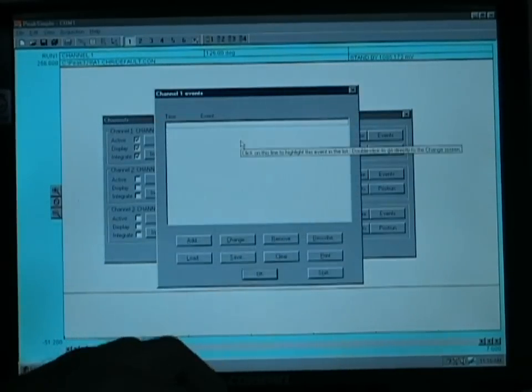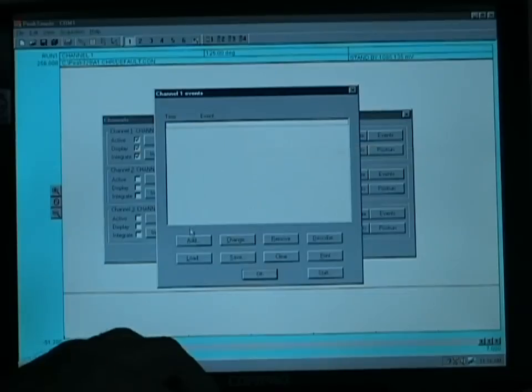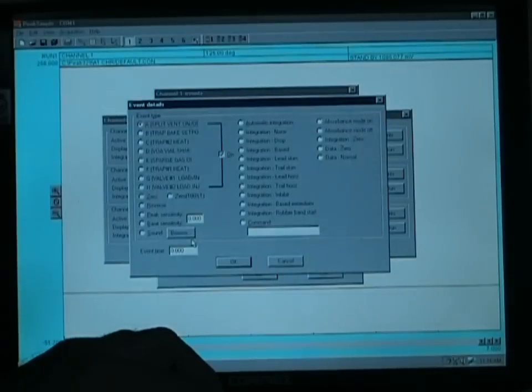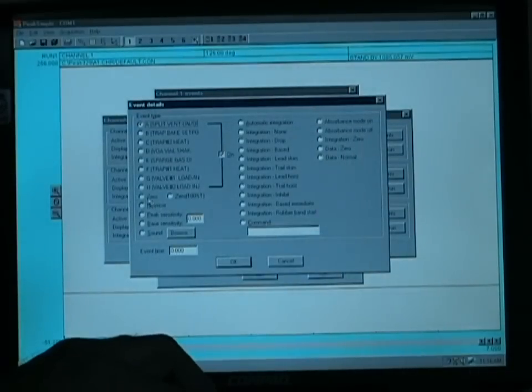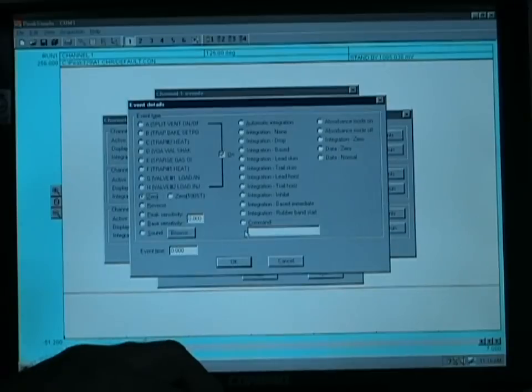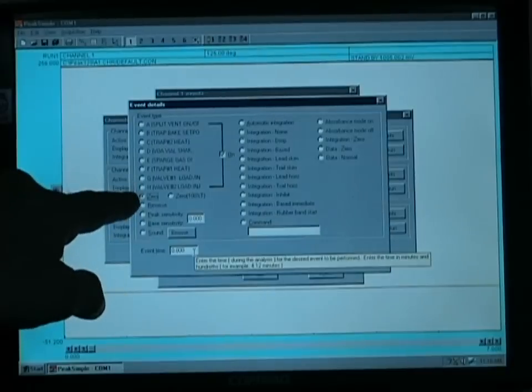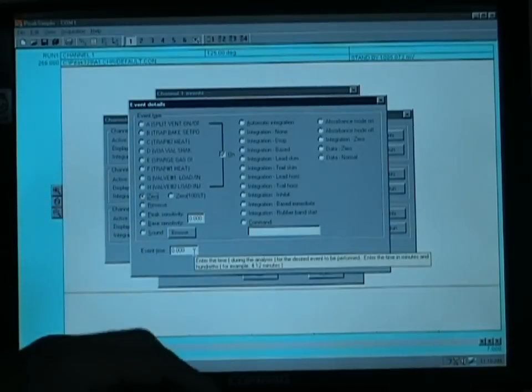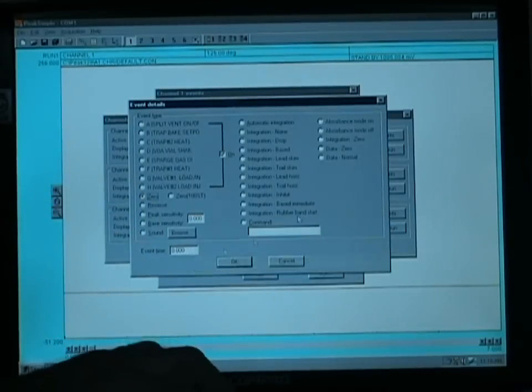The Event file allows us to control the chromatography or any hardware, and basically it is a good idea to start with an Auto Zero at the beginning of the run.